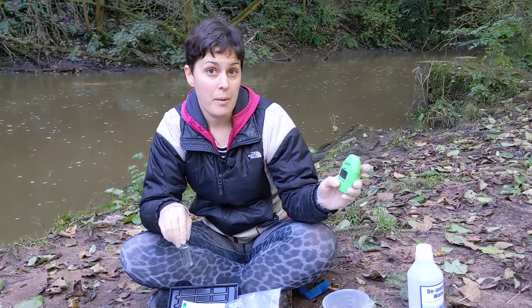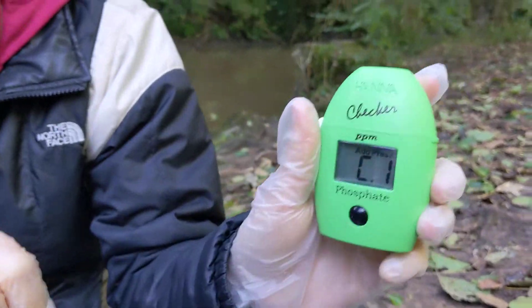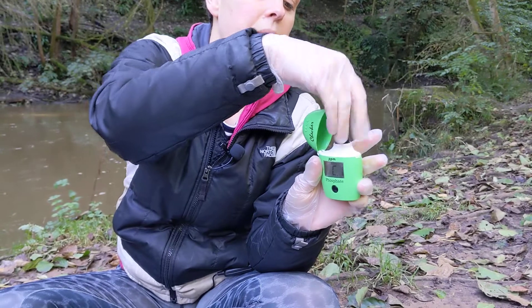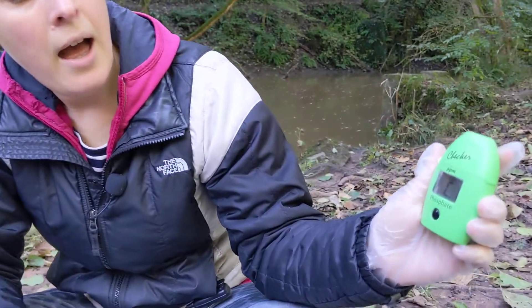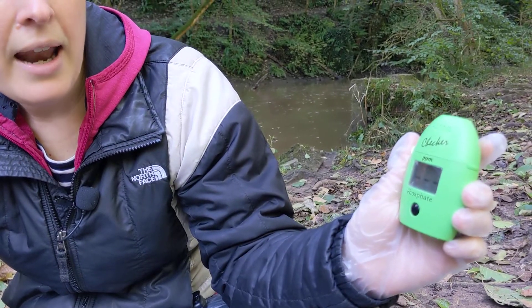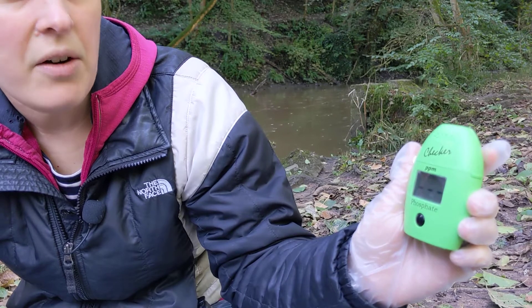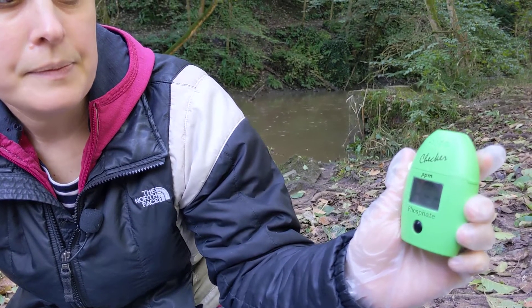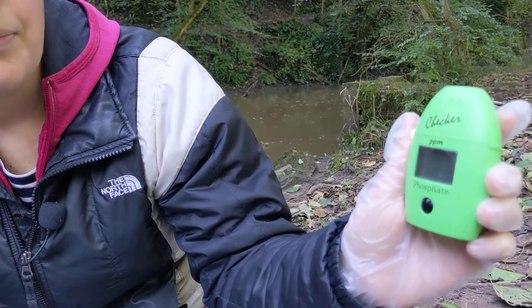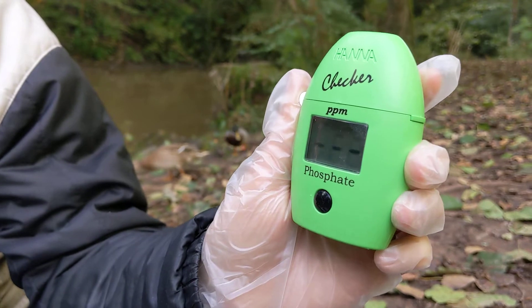Switch on your phosphate checker by pressing the black button and wait until it says 'add C1'. Then pop the lid off and insert your cuvette. Shut the lid and wait. The checker is now zeroing — it's looking at the colour of your water and setting the zero point. Wait for the flashing lines. Sometimes this can take a little bit of time, so just be patient.